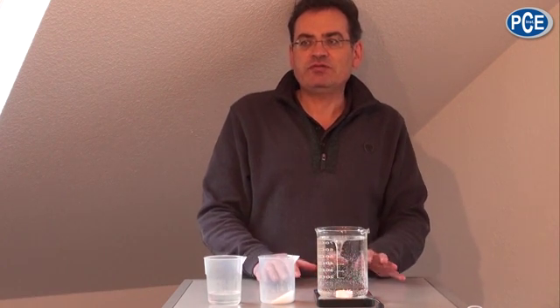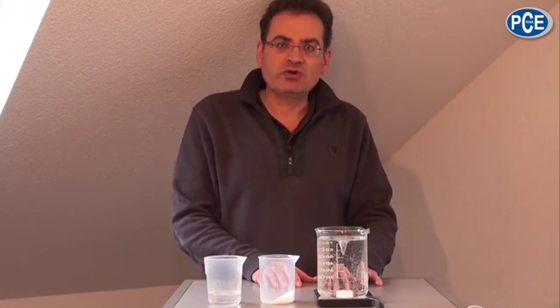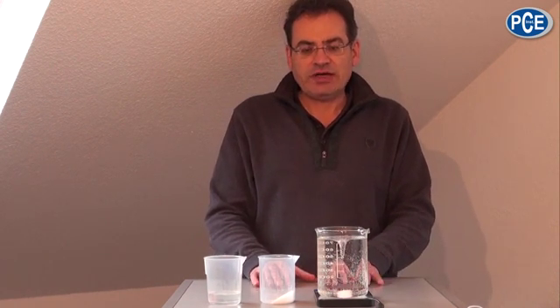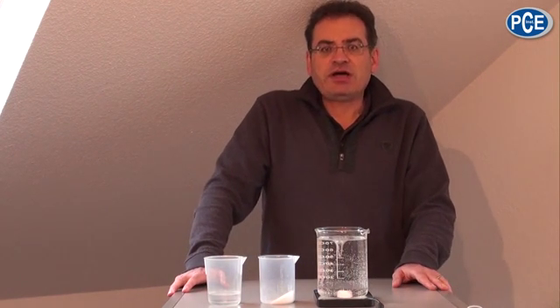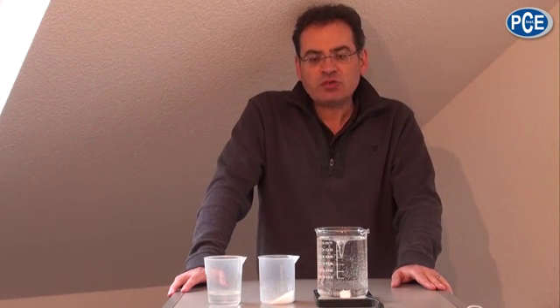The pH value is a value which was defined about over 100 years ago to measure the acidity of the water, to divide it on a so-called pH scale. And we can today very simply measure this value with a device. It is called a pH meter.